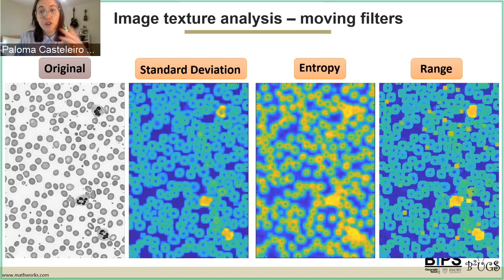So just so you know, these are some of the most simple texture analysis features that you can extract, and these are based on the histogram really, really simply. There are way more advanced features that may extract more hidden, quote unquote, textures, such as fractal analysis, which can tell you about repeating regions of an image. We can extract features related to the co-occurrence matrix, which essentially analyzes the relationship between different pixels in the image depending on their distance. So there are quite a few different ways to extract texture from images, but this is a very simple one, just so that you can see that it is important.